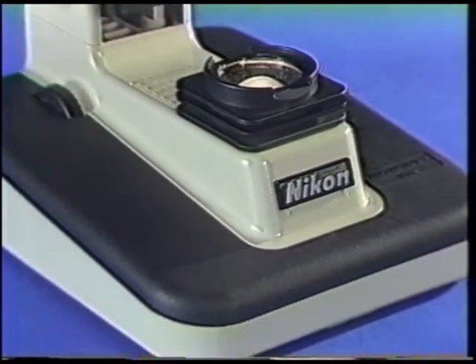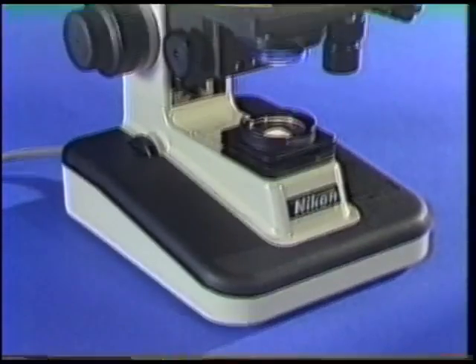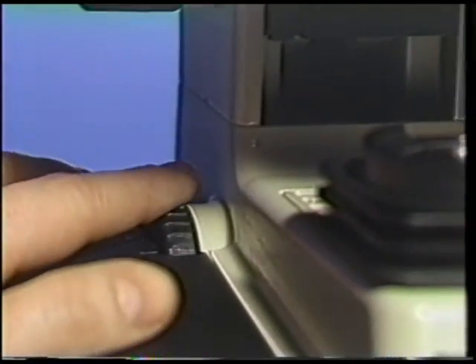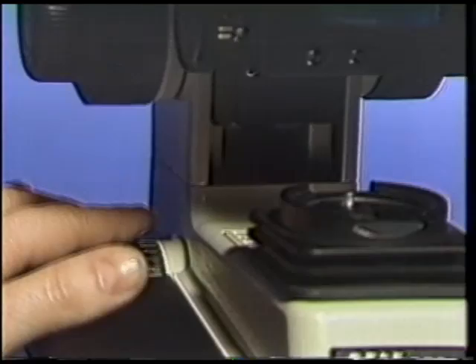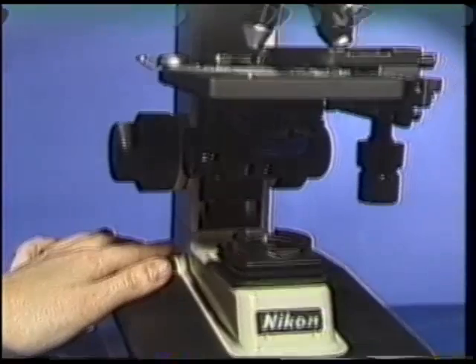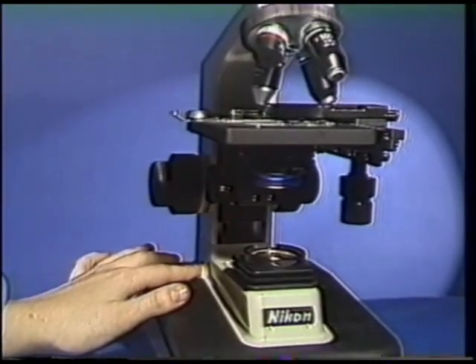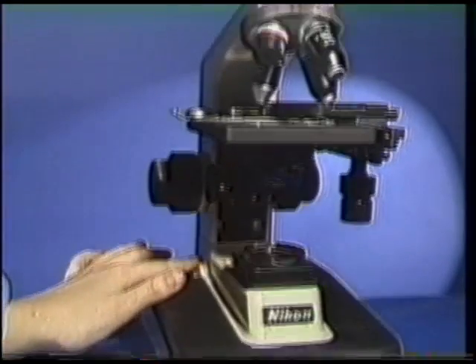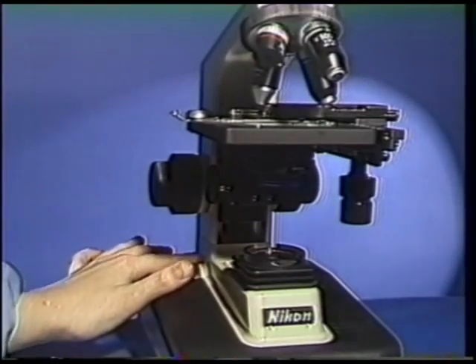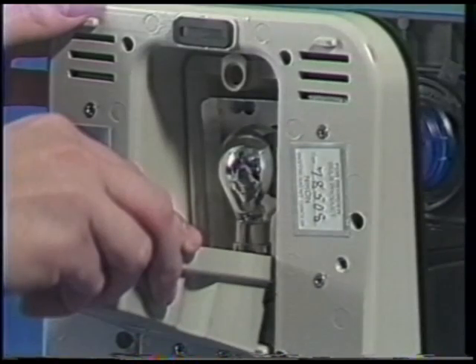The last region of the microscope is the base region, and contains both the power and illuminating sources. On the left side of the microscope base is the brightness control dial. In addition to turning the microscope on and off, it also adjusts the light intensity. Controlling both functions with one switch extends the life of the microscope lamp, because the light intensity is at the lowest level before it is turned off. A 30 watt tungsten reflector bulb under the microscope base provides the illumination.